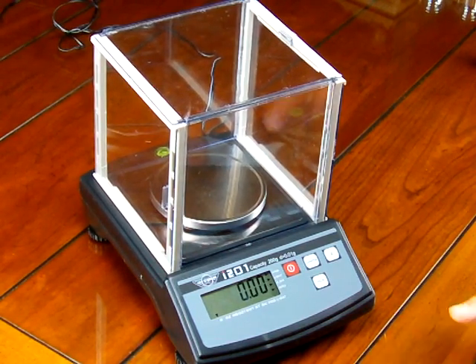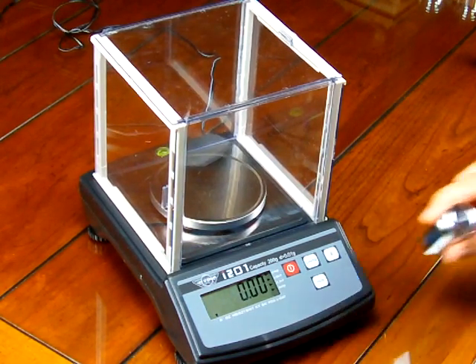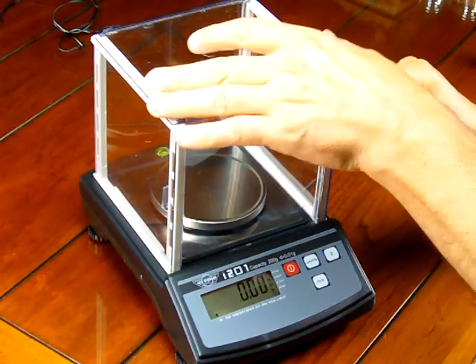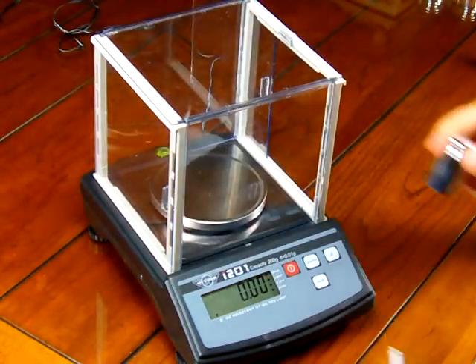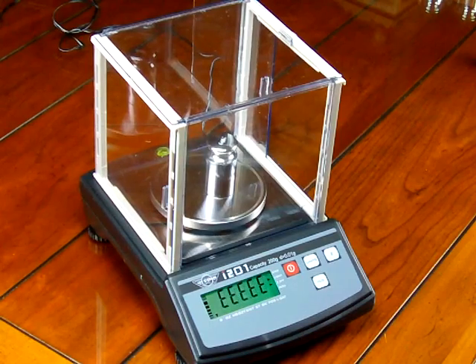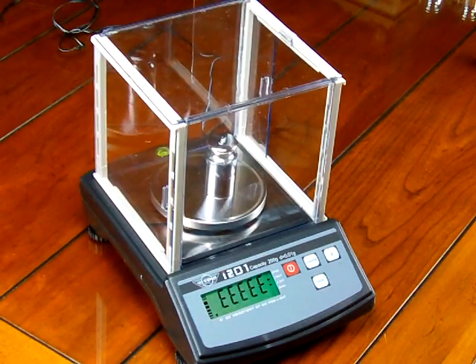The scale is powered up and reads 00. The scale comes standard with a 200 gram calibration weight, so we'll put this weight on the balance to see if it needs to be calibrated. When we place the 200 grams on, it reads EEEE, which is basically overload.